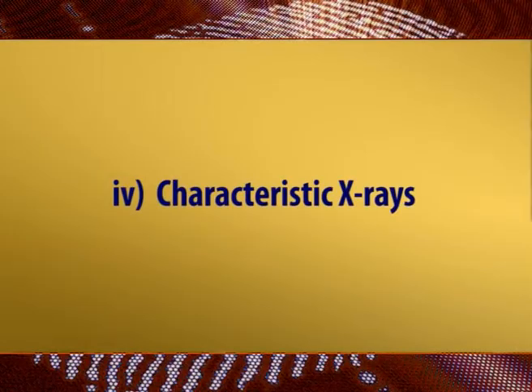However, for ejection, these electrons require a large amount of energy as they are strongly bound to the atom. If the accelerated electron possesses enough energy for its ejection, the inner shell electron is ejected as a high kinetic energy secondary electron.